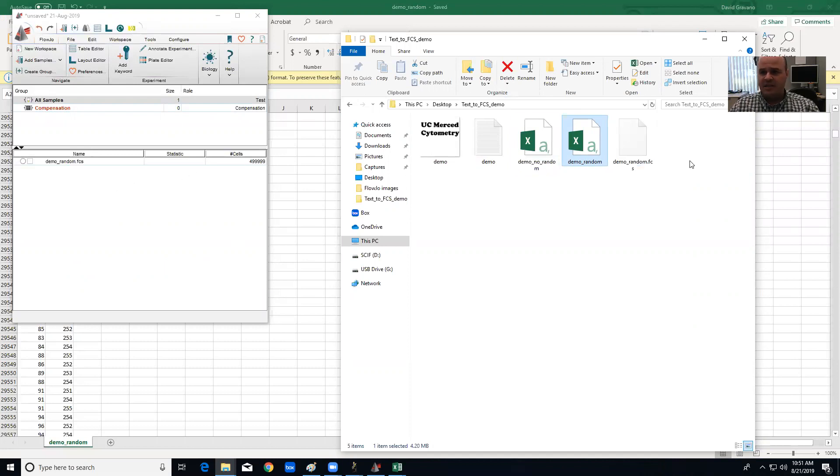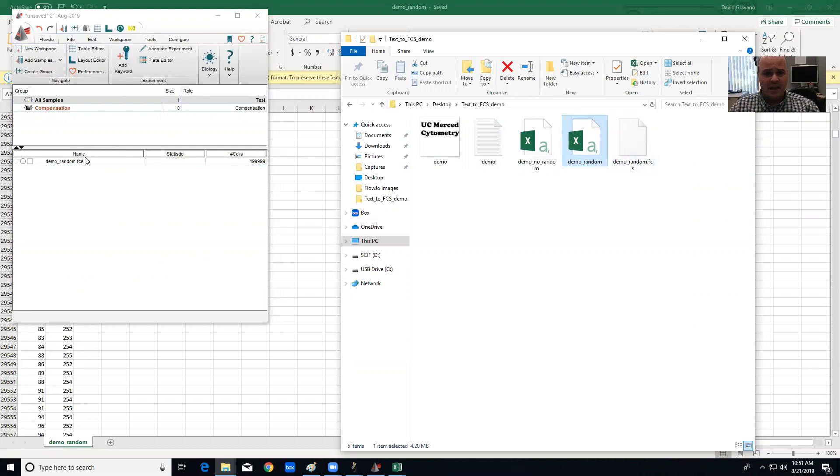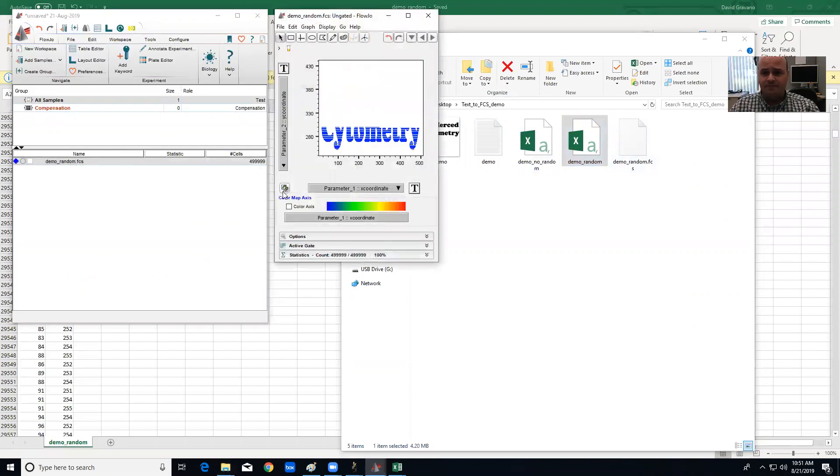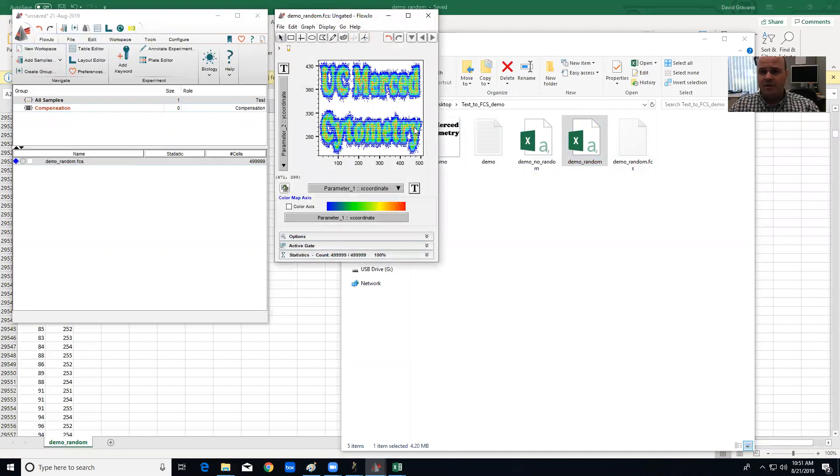Move it there and it's going to take it a second, but you'll see now it's generated an FCS file that's called demo_random. And if I double click on that file, what you're going to see is something that looks like your text.